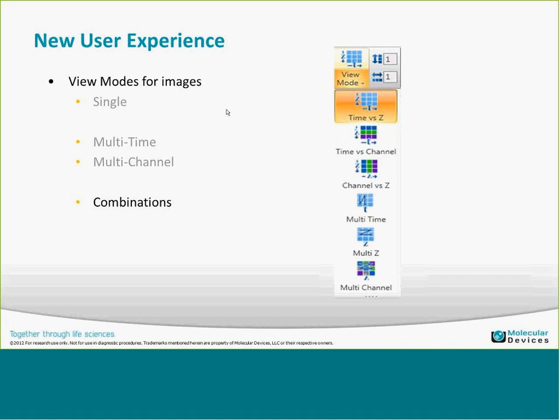As for the film strip on the bottom, there are various ways to view it — by dataset, by time, by Z positions, or by stage positions. You can select a specific time point and it puts that into the center position. Most people will probably have this set to dataset view so they can toggle back and forth between different datasets available to them.